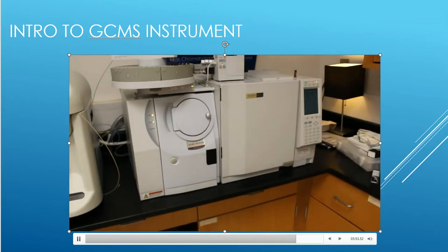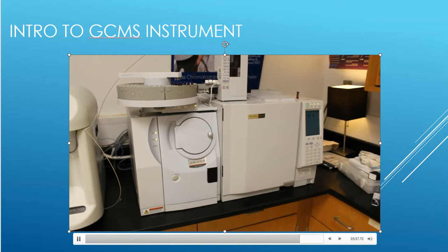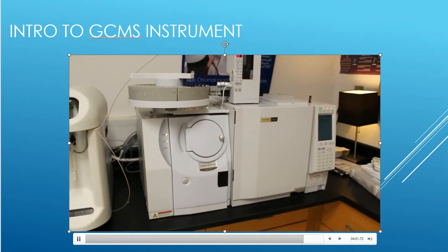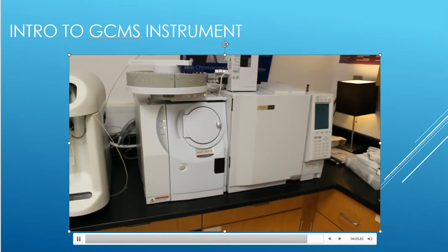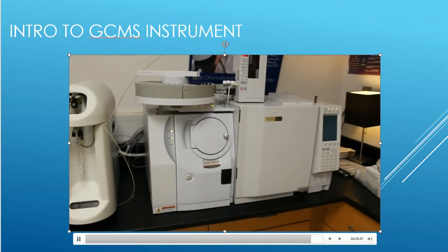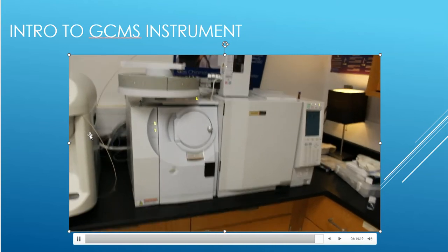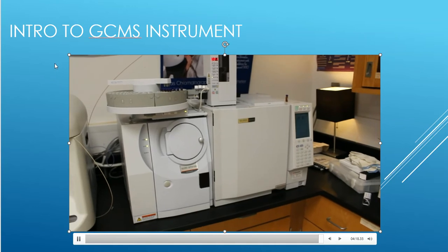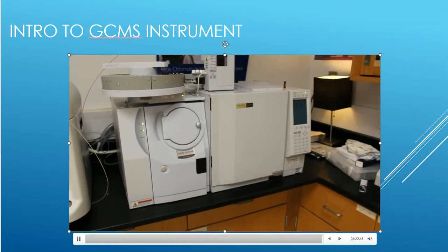All right, so there's your intro to the machine. That's what the machine is doing for us, and we're going to be injecting these samples one by one, and we're going to have to wait and wait. But good news, this does it for me. I don't have to be over here with it for it to get finished. So in about an hour and a half, I'll come back, make sure that all of these samples were injected up at the top, and then double check the chromatograms and make sure that they look good, as well as the mass spectra.